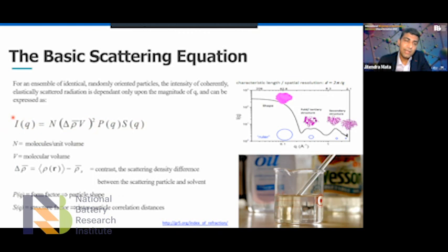So basically, the intensity you see here is a result of the form factor, so the shape and size of the particle, but maybe also the interaction. If particles are very close to each other, or if they have a charge interaction, the scattering is also affected by the structure factor. And the contrast is the huge thing, right? If your solvent and the particle you want to study have the same or similar scattering length density, then your intensity will be nothing. It will be like this. You can't see a glass rod in a liquid which has the same refractive index. So this equation is very important. Whenever you want to submit a proposal or study something, think about all this. Okay, so that was the rough overview of small angle scattering.